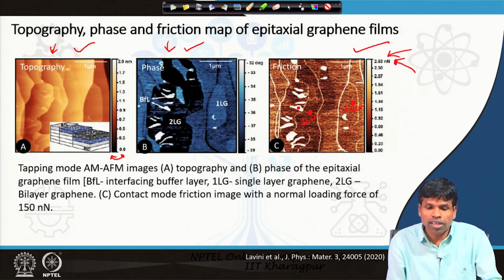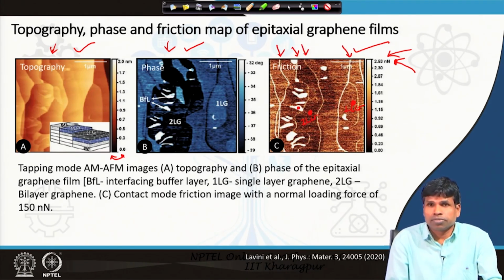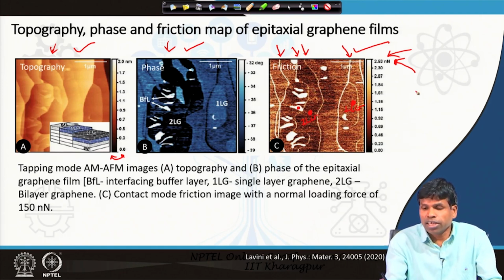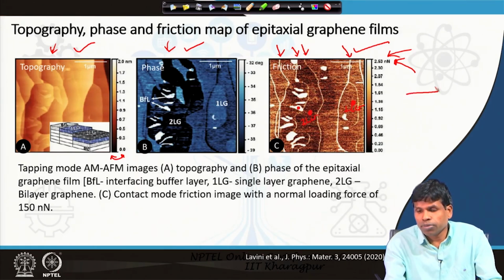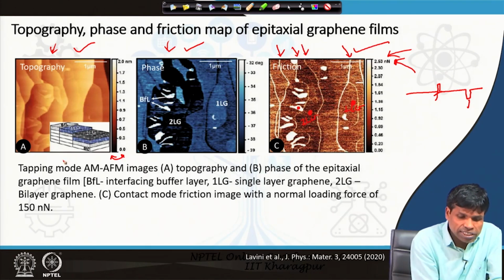In addition to that, you see a much brighter interface edge. As you have seen previously, when we see upward features, we see edges, convex or concave edges, and this contrast is also clearly seen when one layer graphene changes its position to another, as in this schematic diagram.